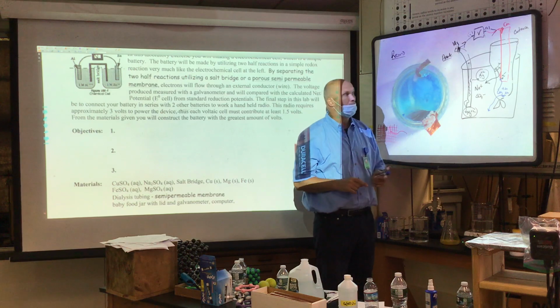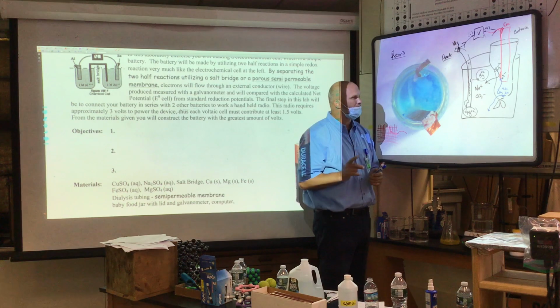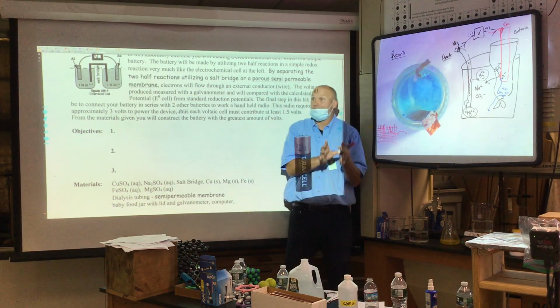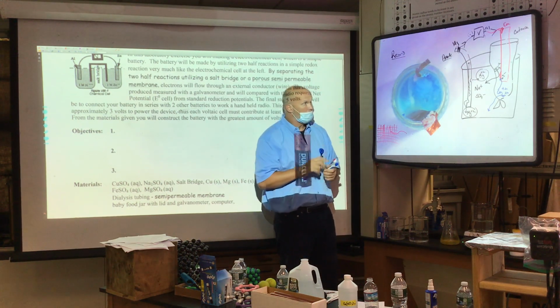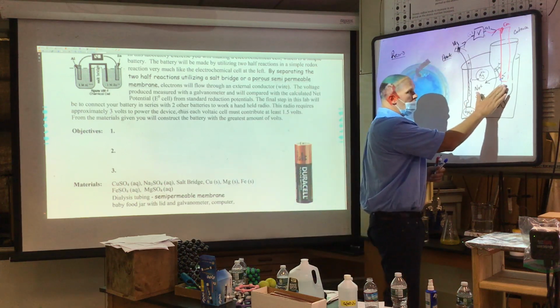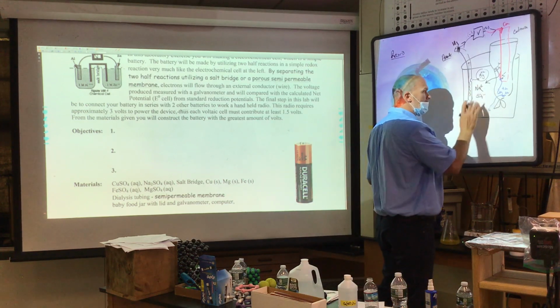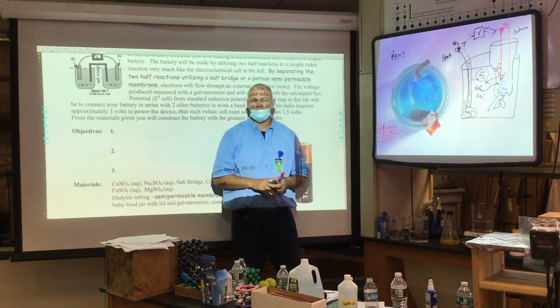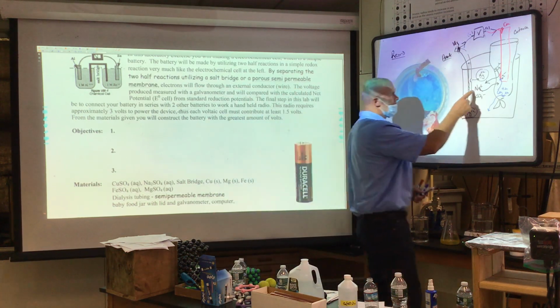But in terms of the copper that we got reduced, the copper 2+ that got reduced, I should say, specifically, because the copper didn't get oxidized nor reduced. The copper was just like a conductor, just like the platinum was in the other one I showed you previously. So the copper 2+ is disappearing, which means this beaker is getting negative, so we needed the what? Sodium ions that were already in the solution to move through the porous semi-permeable membrane, and that's your salt bridge. If those ions could not get to those respective places, there would be 0 voltage.